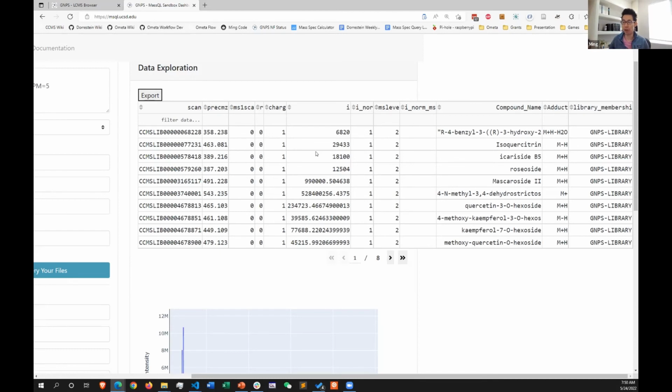And going forward, we're making this language more universal, in the sense that we're working with people at MZmine, at MS-DIAL, and OpenMS, and they all have support now for MassQL. So you can write your query at GNPS right now and try it on your data there. But in the future you can take that same query, exactly the same query, and plop it over to MZmine or OpenMS, whichever software you're analyzing your data in at the moment, and execute the same operation.